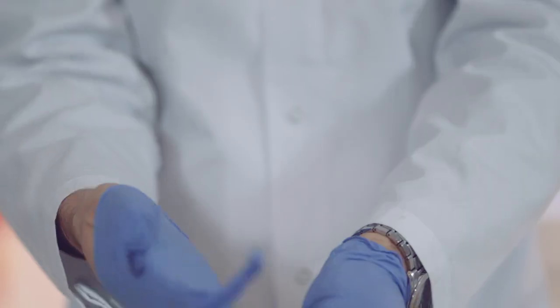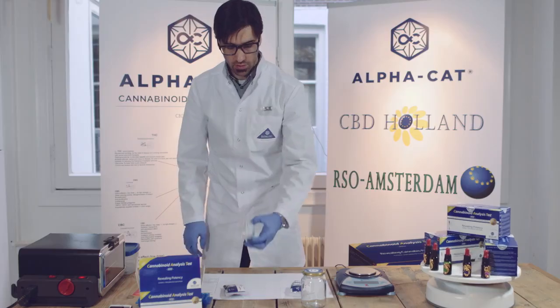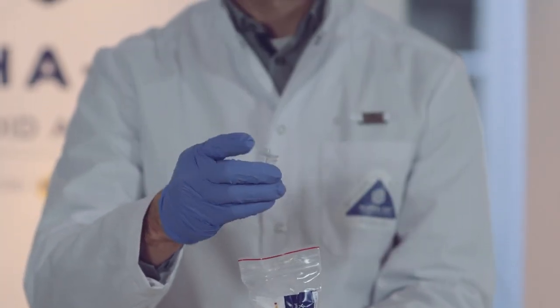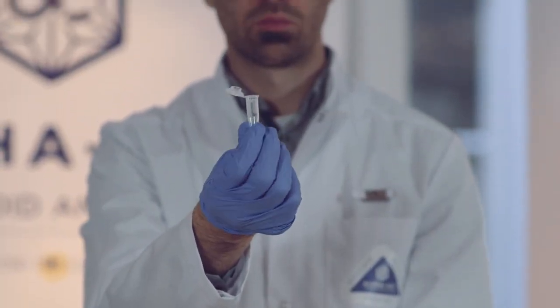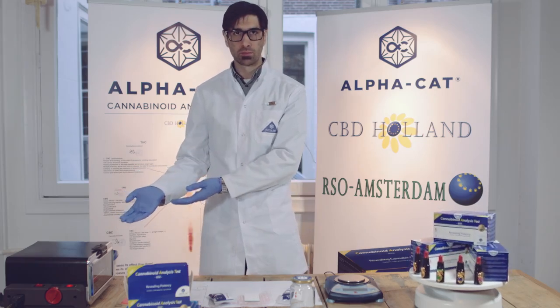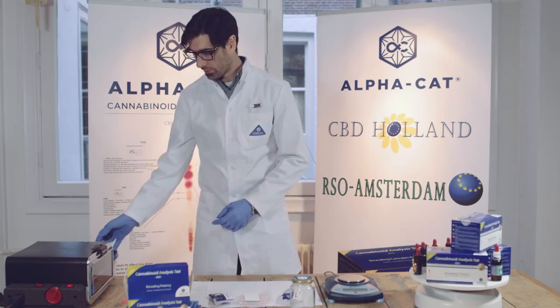The kit includes, among other things, gloves, test plates, and tubes. The only thing you need for yourself is an oven in case you plan to decarboxylate your sample, a scale, and your testing sample.